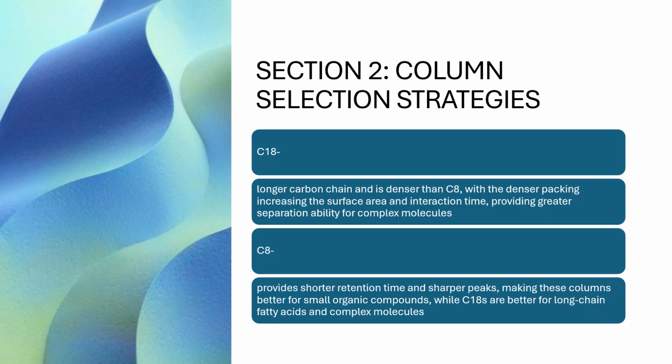When should you choose C8 columns? Now C8 provides shorter retention time and sharper peaks, making these columns better for small organic compounds, while C18 are better for long chain fatty acids and complex molecules.